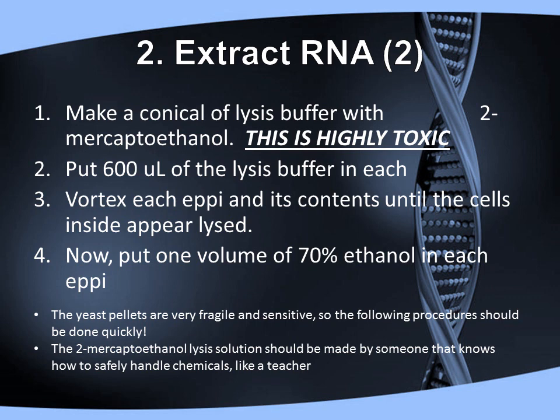Do note that the yeast pellets are very fragile and sensitive, so you have to be really careful and move very quickly while the yeast cells are not stored at negative 80 degrees Celsius.